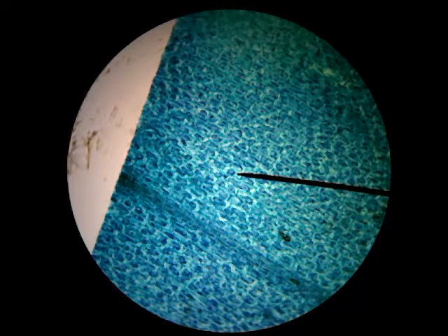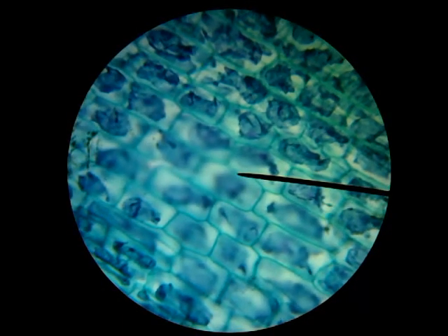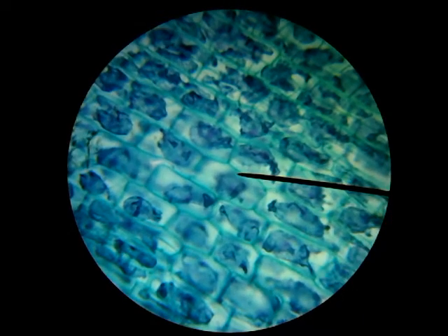Now I'm going to my blue objective, which is my longest objective lens. Using my fine focus, here we are seeing the actual cells of the elodie leaf. Each one of these little walls is a cell wall for each cell — notice how very rectangular they are, fitting together like bricks in a wall.